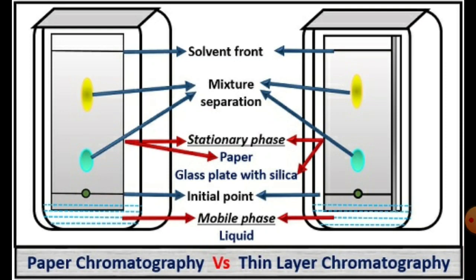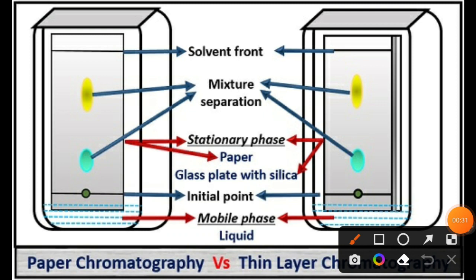In this video tutorial we are going to discuss affinity chromatography and ion exchange chromatography. Before going to talk about affinity chromatography and ion exchange chromatography, I want to revise our previous class where we discussed paper chromatography and thin layer chromatography, the two simplest types of chromatographic technique.